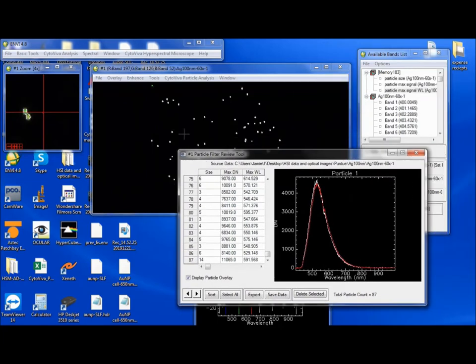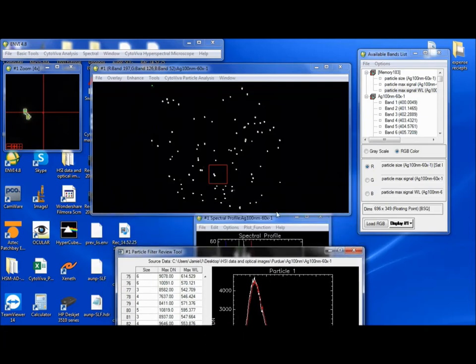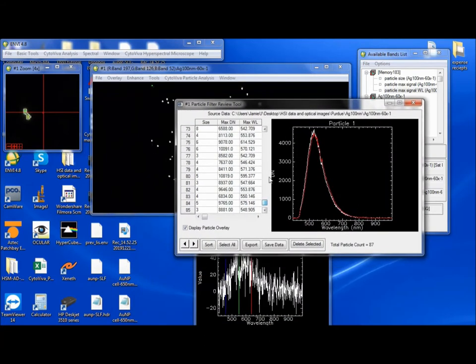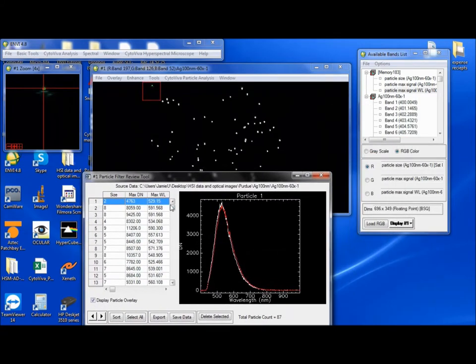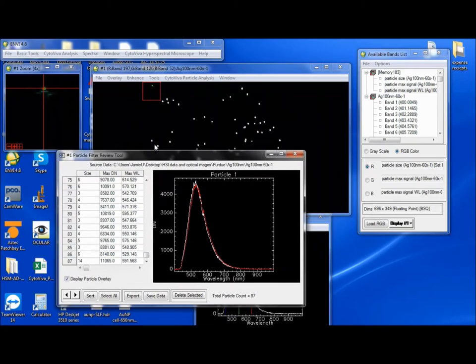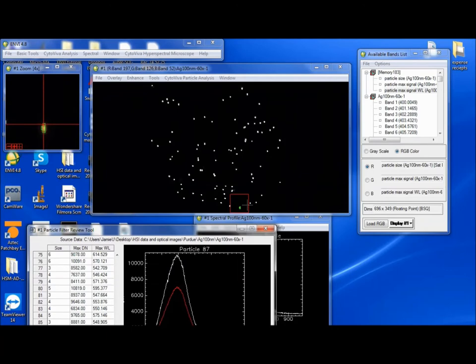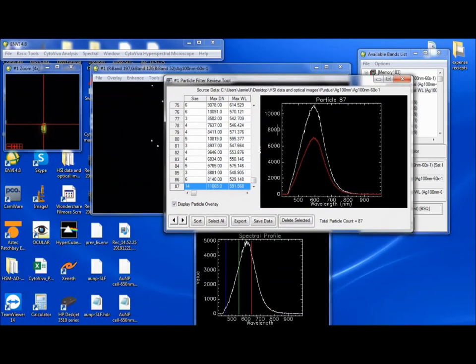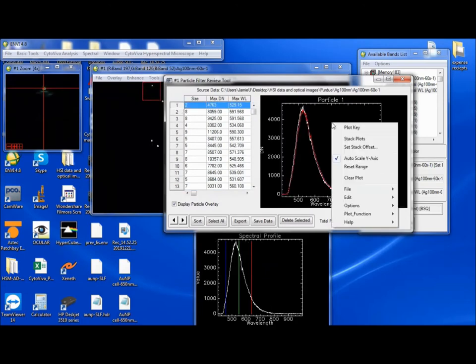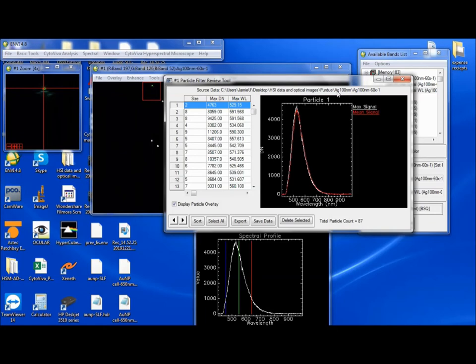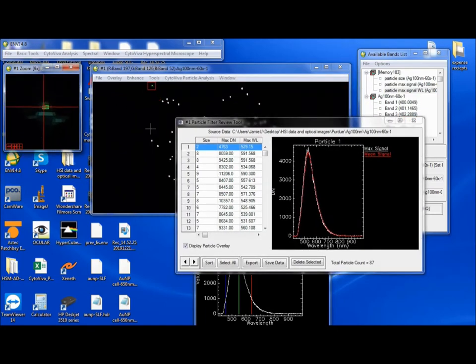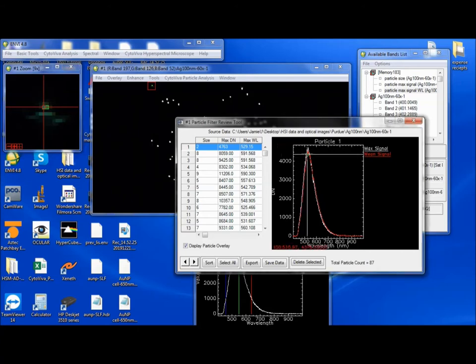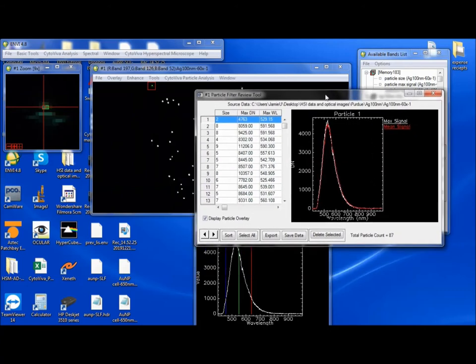And the way this works is the particle filter counts and labels the particles from top left all the way down to bottom right. So particle number one should be at the most top left of the scan. And if we go all the way down to particle 87, it's the one that's at the bottom and furthest right. So that would be this one here. And you'll notice that when we click on these, this window here, and if we right click to show the plot key, there's a max and a mean signal. So this particular particle, I'm going to zoom in on it, it's two pixels, has a maximum intensity of 4763, and it has a peak wavelength of 529. So if we go up here, we see peak is right around 530, 529.1. So that gives us this information.